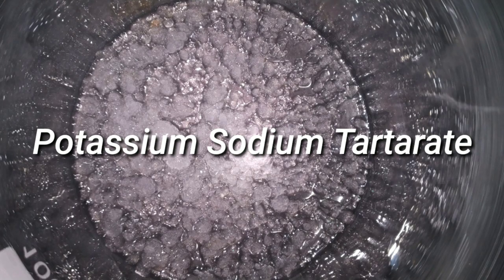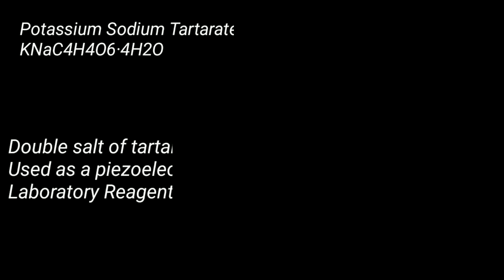Friends, in this video we will make a double salt, potassium sodium tartarate, also known as Rochelle salt.